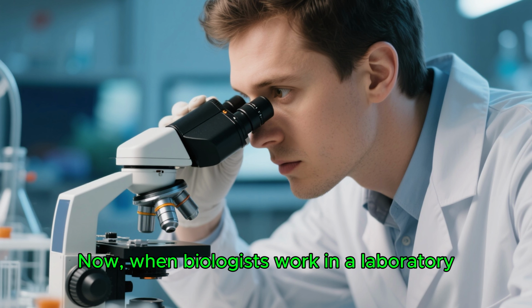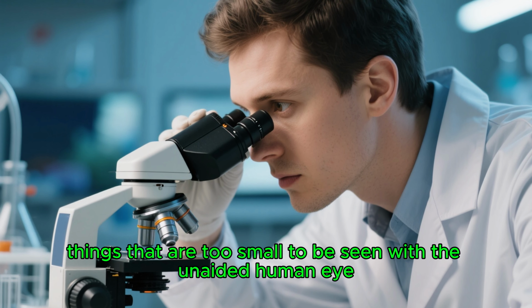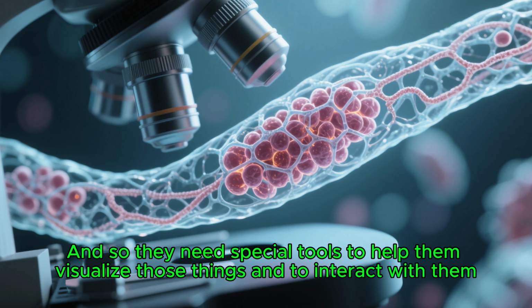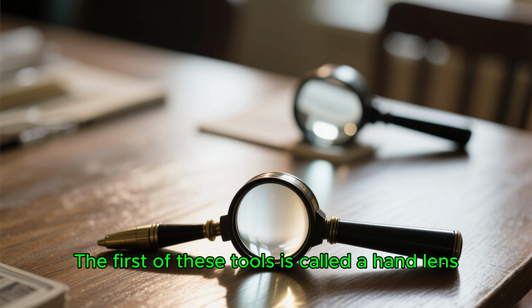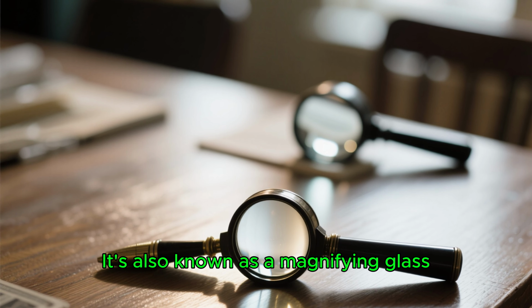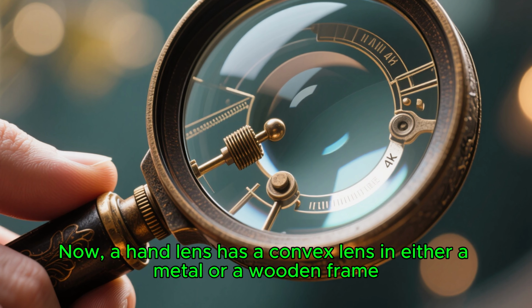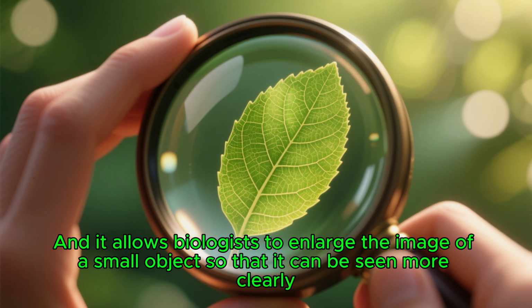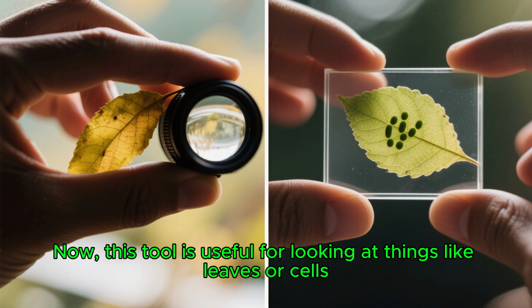Now, when biologists work in a laboratory, they are normally working with very small things that are too small to be seen with the unaided human eye. And so they need special tools to help them visualize those things and to interact with them. The first of these tools is called a hand lens, and that's shown here. It's also known as a magnifying glass. Now, a hand lens has a convex lens in either a metal or a wooden frame, and it allows biologists to enlarge the image of a small object so that it can be seen more clearly. Now, this tool is useful for looking at things like leaves or cells.